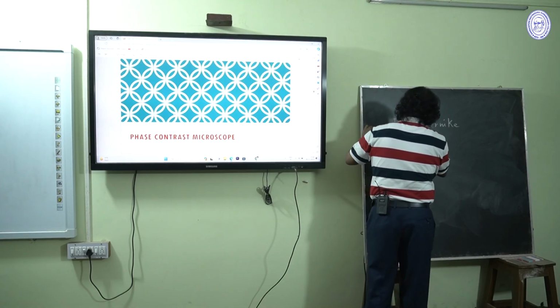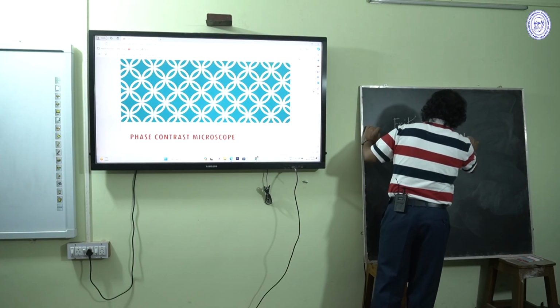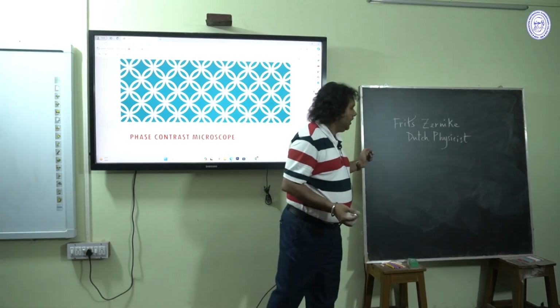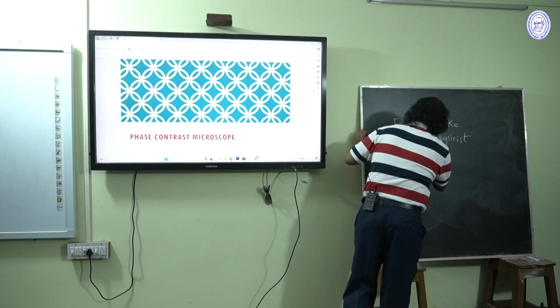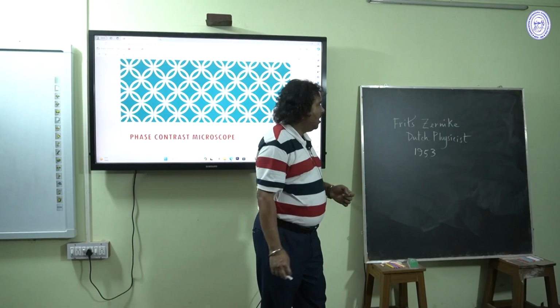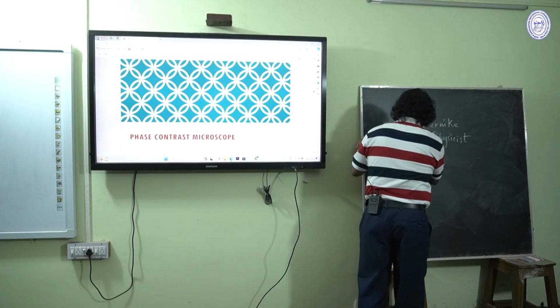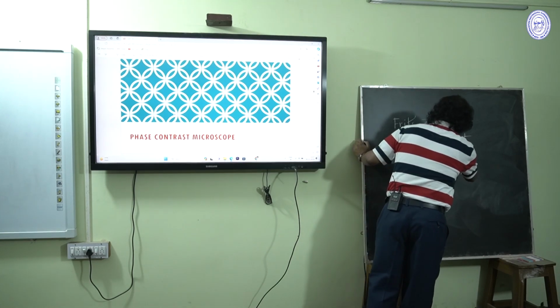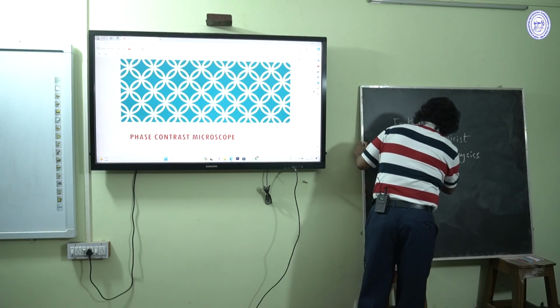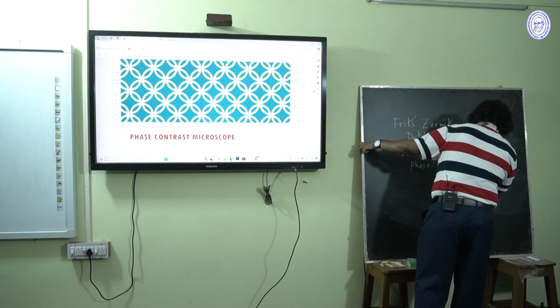a Dutch physicist, that is, he is from the Netherlands. In 1953, he was awarded the Nobel Prize in physics for the invention of phase contrast optics.